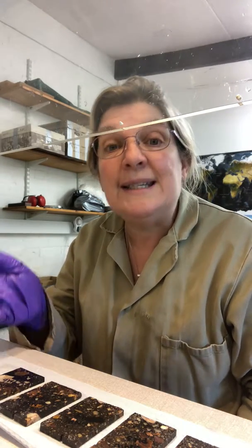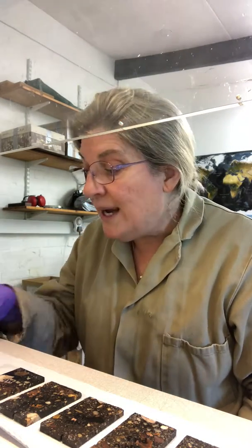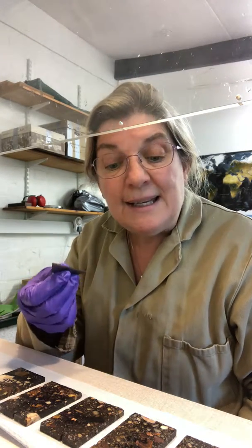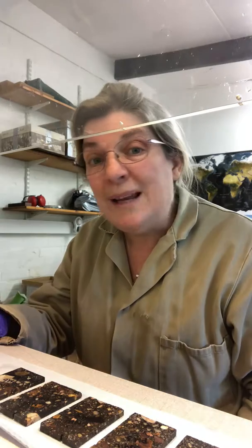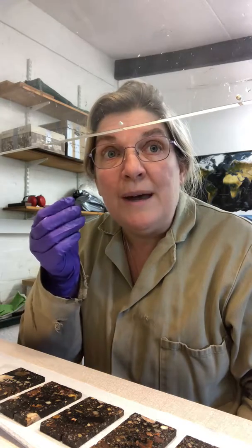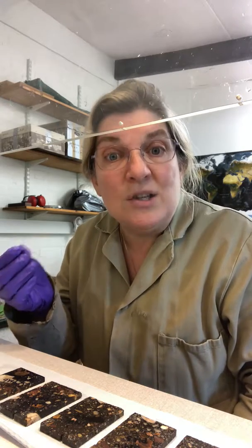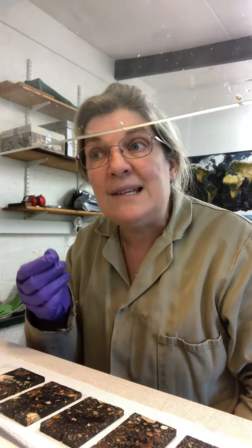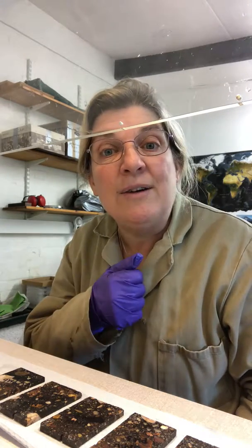So my only advice here is absolutely run your sets, leave them overnight in order for the super glue to ease the bond, and then come back after 24 hours and try to use your blade, wedging it under the glass to see if you can get some movement. If you can't, you can try to flood the sample with a little bit of acetone to ease up that glue, soften it up. But the best is that it lets go itself. I will show you this process on the last 2 sample slices, which I ran this morning, and we'll get that in there in these videos somewhere.